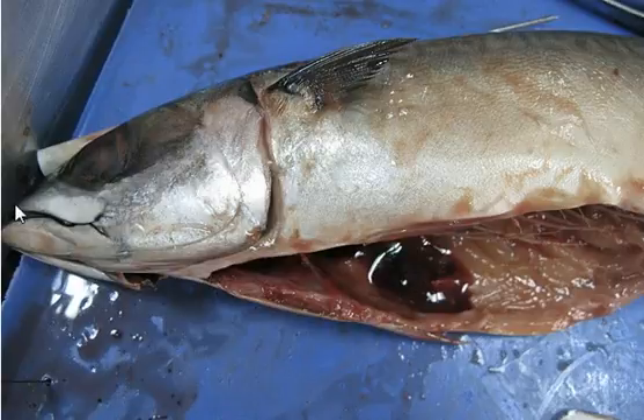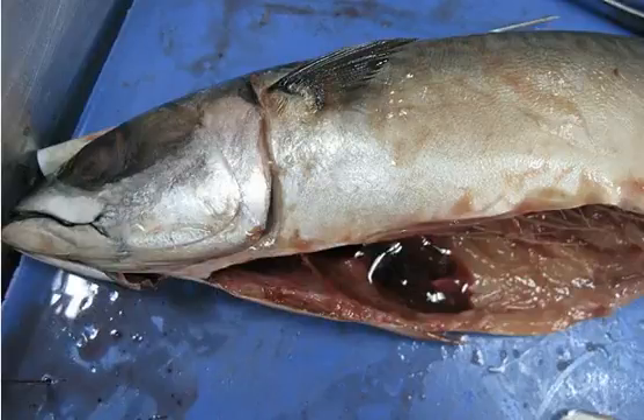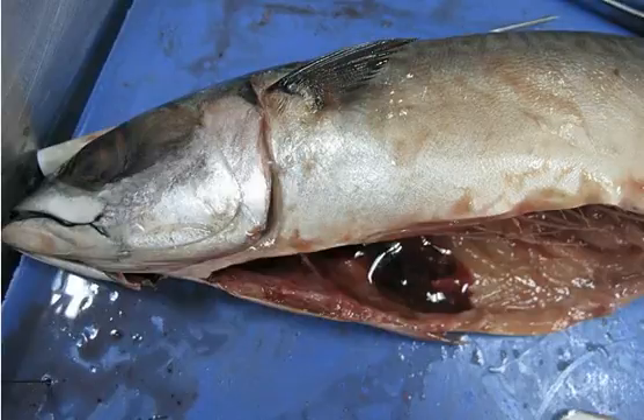The gills are inside, and how it works is that when the fish swims through the ocean, water goes in through the gills and then comes out, and that's how the fish breathes. Now this thing over here is the dorsal fin, and this over here is the end of the tail.